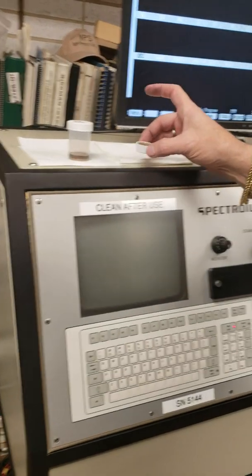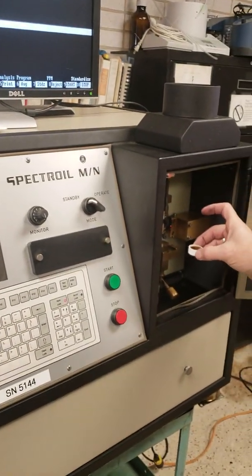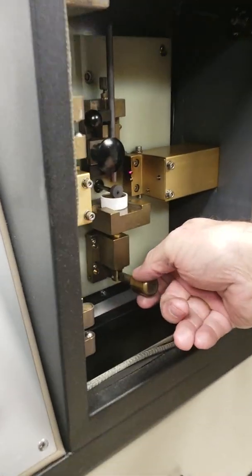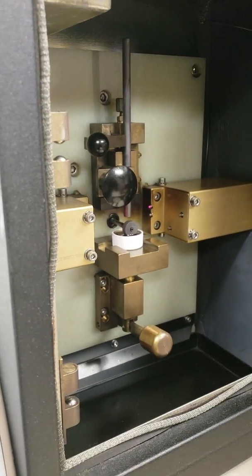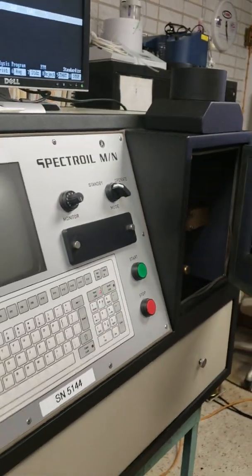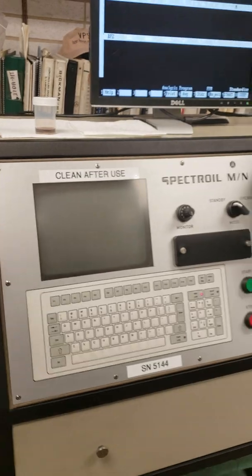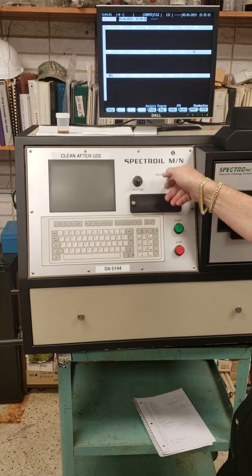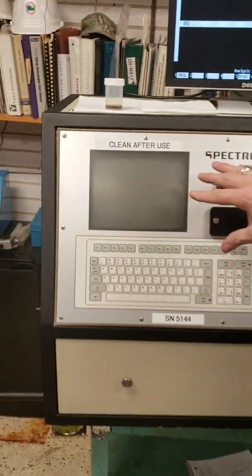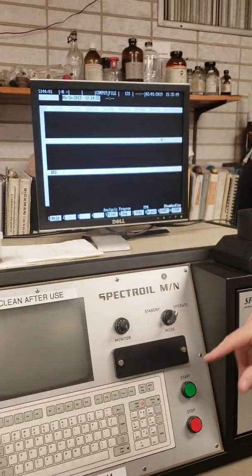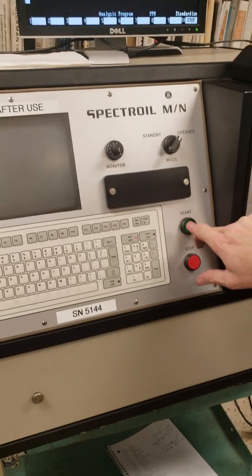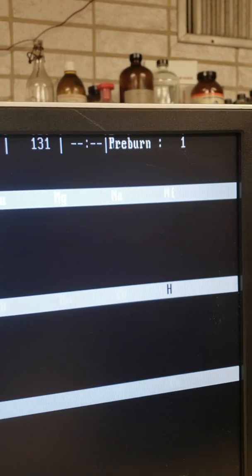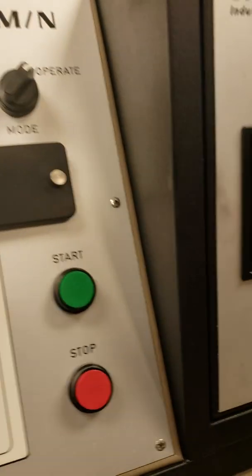We're going to take an oil sample here — this is 100 parts per million — and put it in here. Then we're going to lift up on this handle, and that will put the disc inside the oil. Then we're going to close it and turn this handle to operate. As you can see, this has a small screen on it, but it's really hard to read, so we put a bigger screen on it. Then all you do is hit the start button. You can see where it's pre-burning, and then it will start to measure.